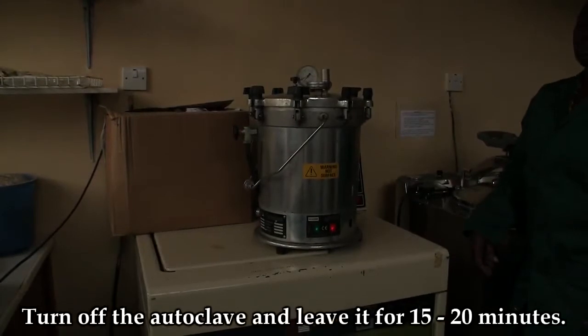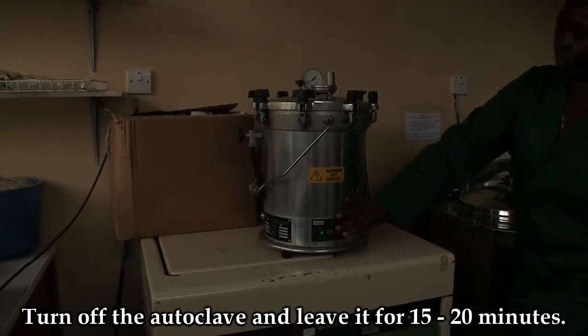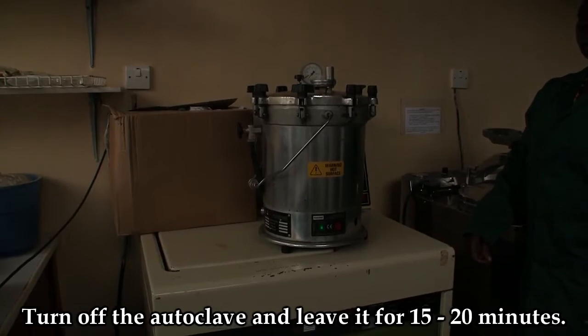Turn off the autoclave and leave it for 15 to 20 minutes.